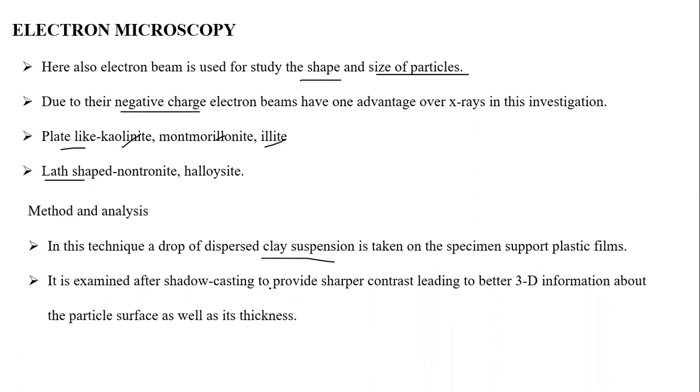And by spreading the matter and doing all this, we will get better 3D information about the particular surface and wall thickness. This is what, students, we will get: 3D images. We will know the shape and the arrangement, everything we can read from this electron microscope.